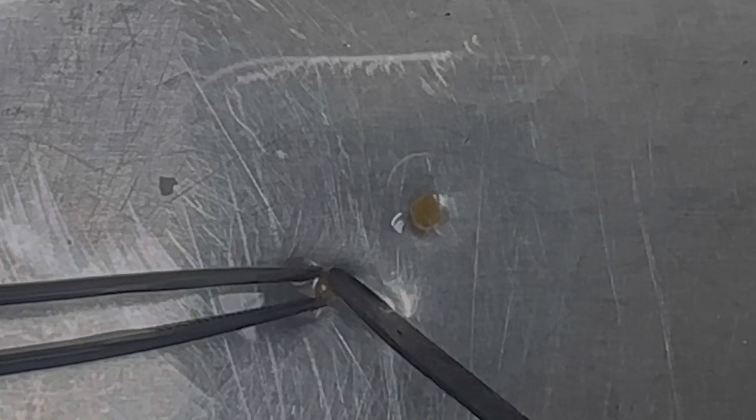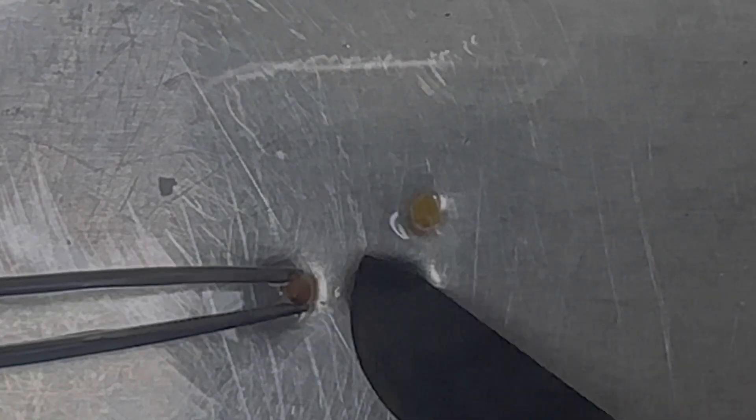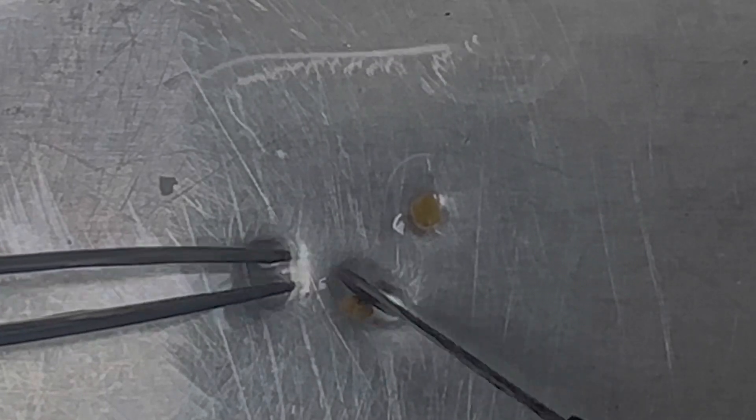I'm trying to peel off the leaf primordia and leaves, leaving just the shoot tip essentially. Now this is not the full shoot apical meristem where you are only leaving the apical meristem — that's not what I'm doing here. I would definitely need a microscope to do that kind of detail work.